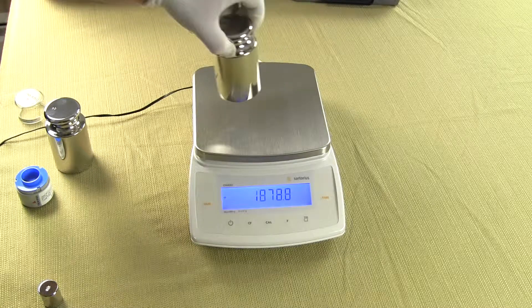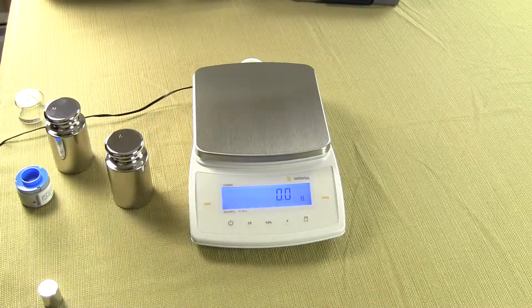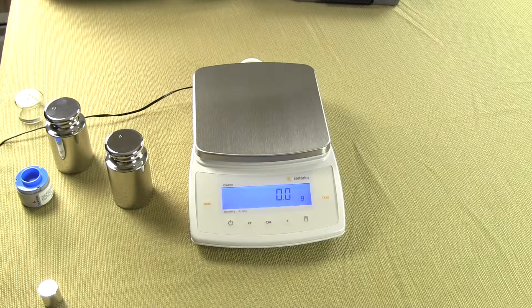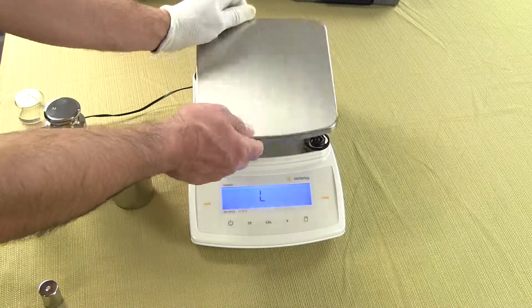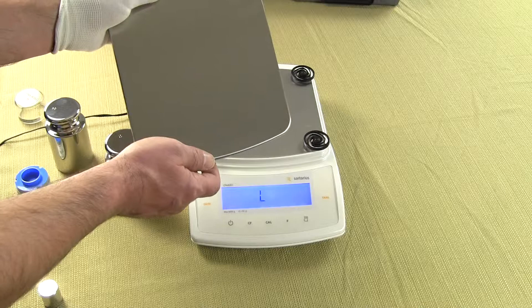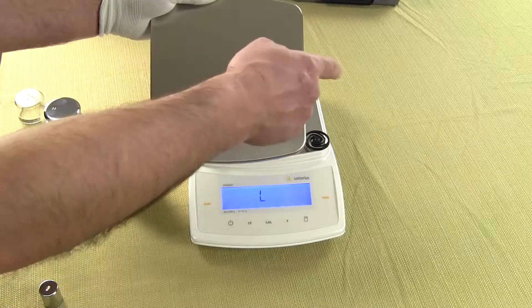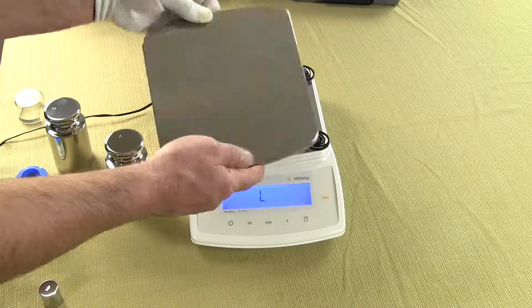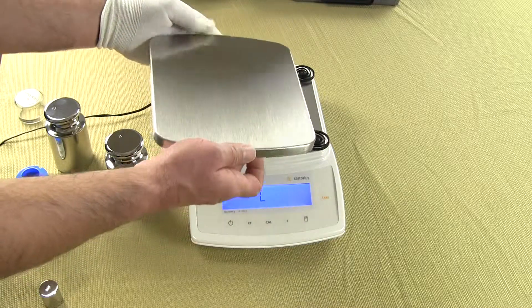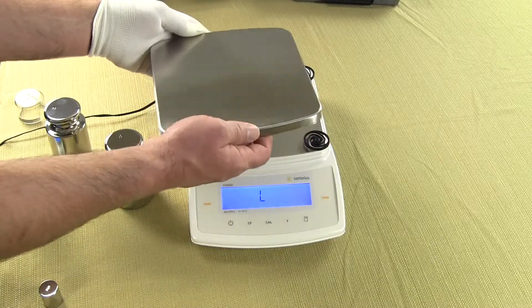The balance has a nice large stainless steel platform. This particular platform here is seven and a half inches by eight inches. So you have seven and a half by eight inches. So it's a very large stainless steel platform. Removable so you can clean it.